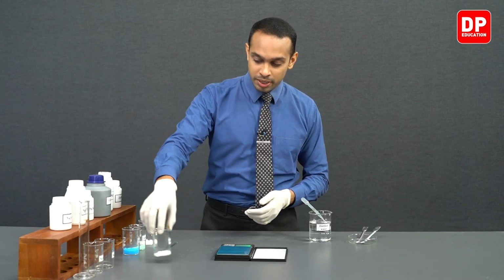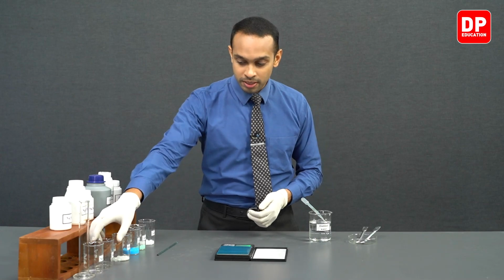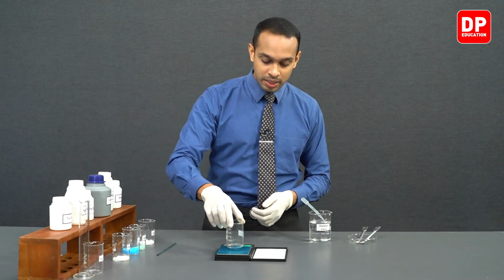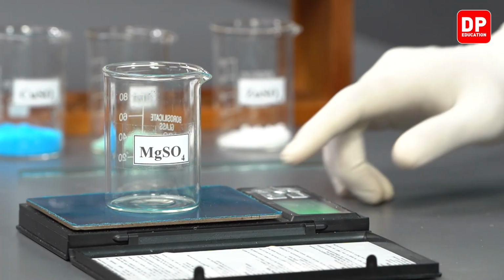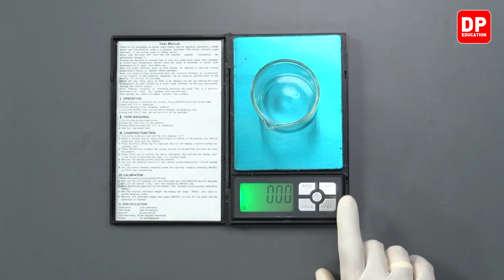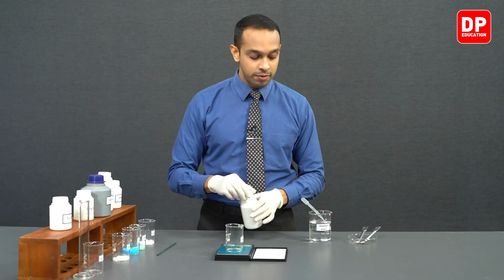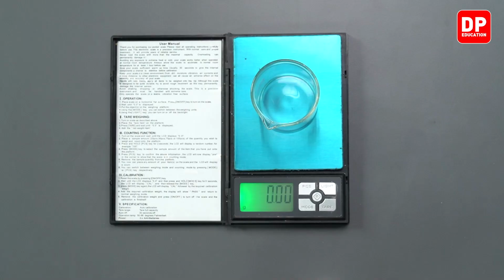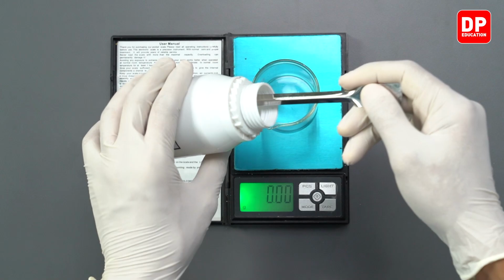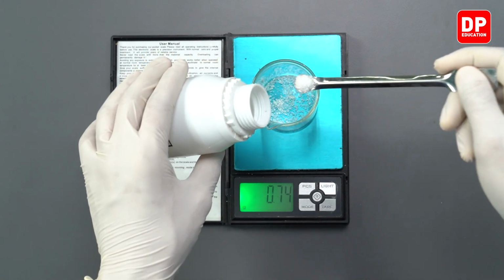So now students, after making that observation, we can move back into measuring magnesium sulfate. So we have a magnesium sulfate labeled beaker here, and then we will tare the beaker. After taring the beaker, we can measure the magnesium sulfate needed for our experiment. We need 6.02 grams of magnesium sulfate. So we will measure 6.02 grams.